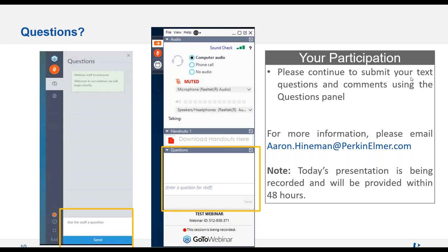So when I tried to do this on the old Elan, I really couldn't see 6. I could see 7, but I really couldn't see 6. It was just that the sensitivities were too low. The advantage of the next... Yeah, low mass sensitivity was much lower on the Elan design optics.